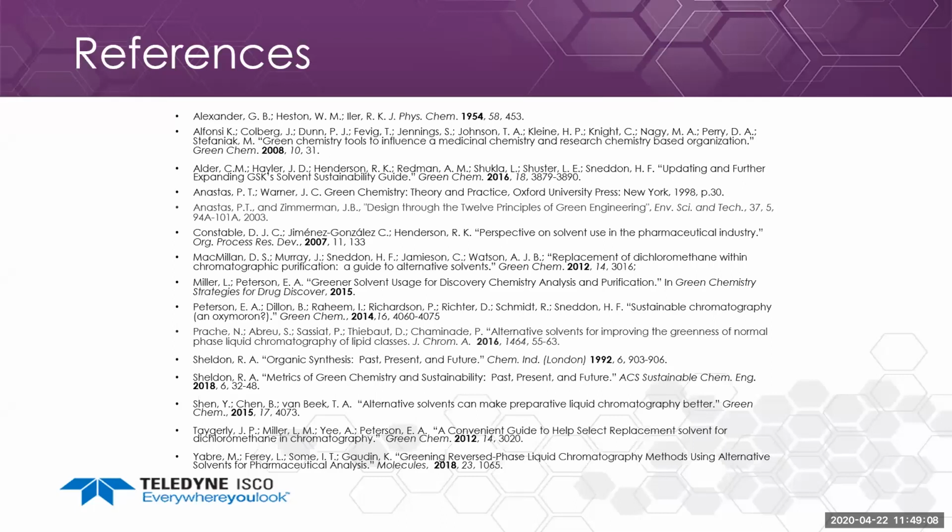One of the questions is, does using water affect the CombiFlash pumps or not? The water is fine for the CombiFlash pumps. If you're going from normal phase to reverse phase on the NextGen or any CombiFlash system, we have a tech note describing how to go between them to ensure that you don't have an immiscible solvent like hexane in there when you're trying to flow water.